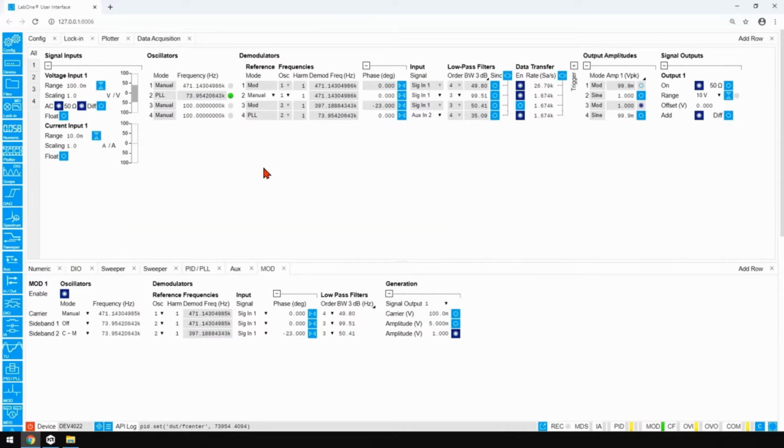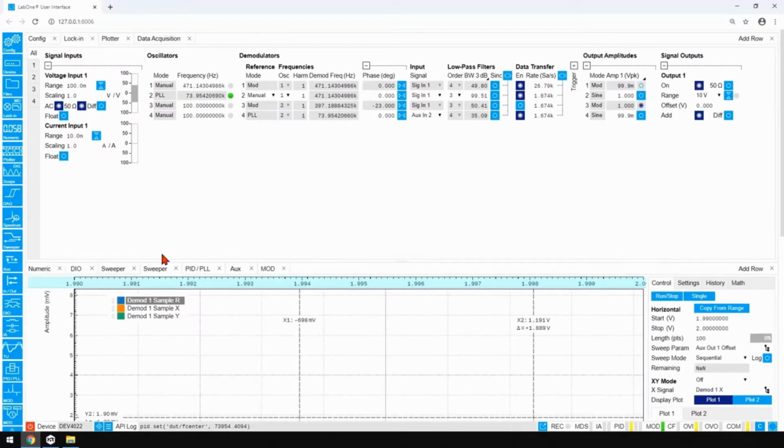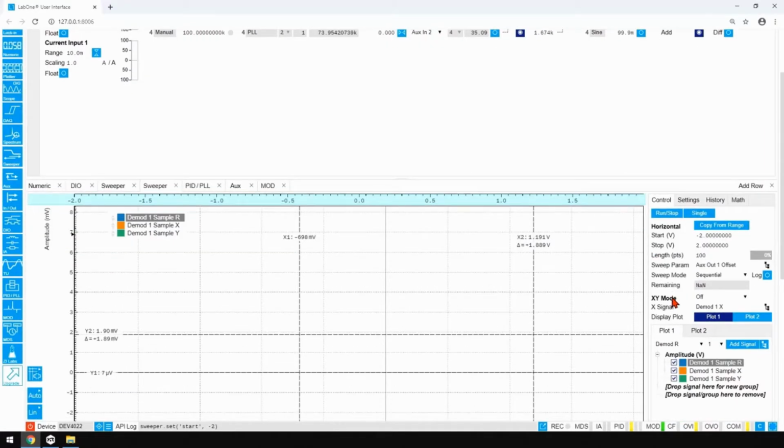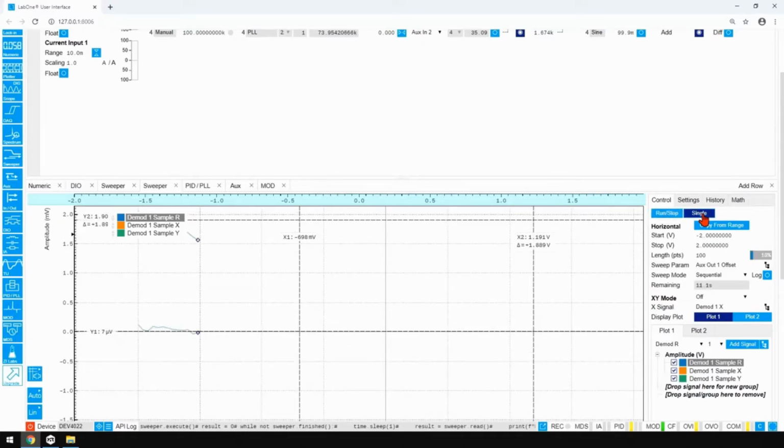So we are again at the second eigenmode frequency, and we don't need to sweep it again. But on the other hand, we are interested in looking again at the behavior of the amplitude as a function of the DC bias. So we are applying the DC and looking at amplitude 1 as a function of DC.